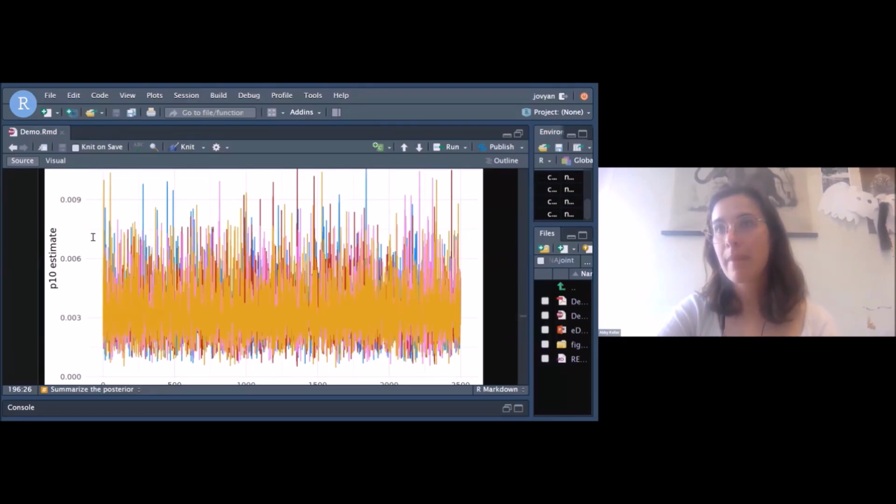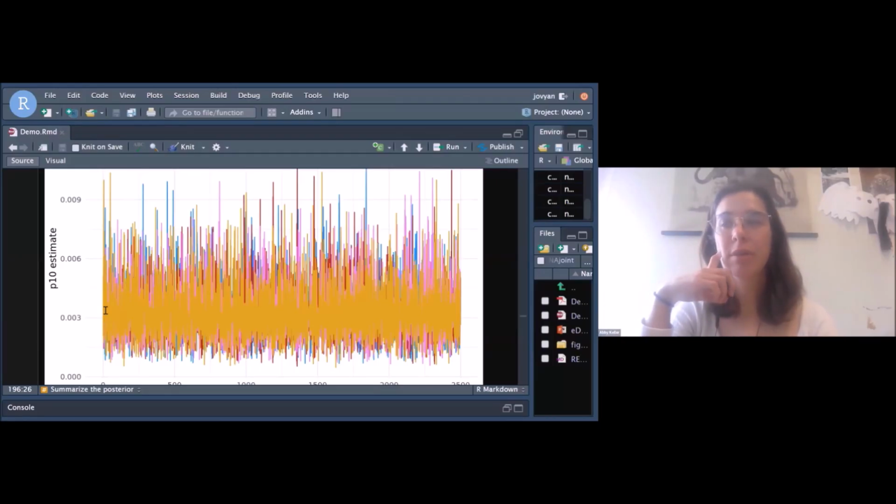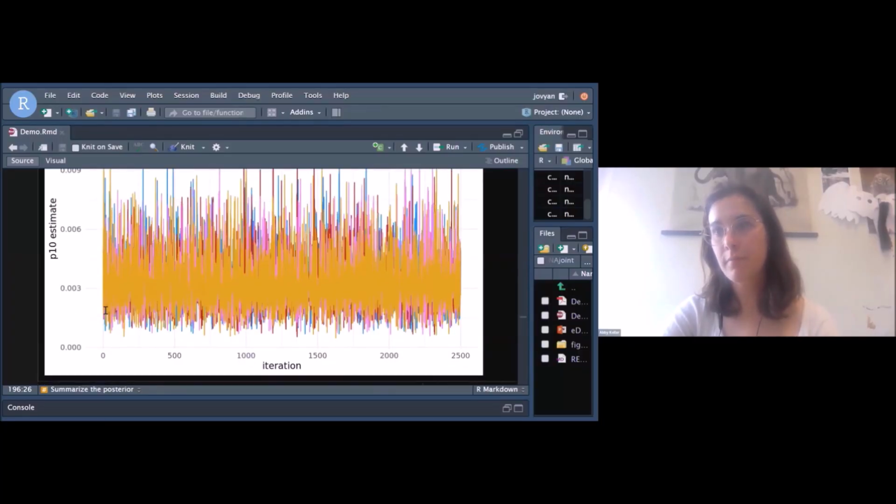So we're looking for this trace plot to be stationary. That means that these chains are moving around the same mean with the same variance. These trace plots are super useful for both sanity checking that we can rely on these results, that the algorithm has converged, and also, if it hasn't converged, trying to diagnose what's happening. So highly recommend creating and using trace plots.